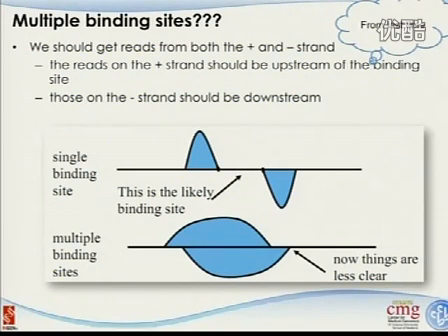And so once you do the analysis, you want to go back to the genome browser to take a further look at whether your strategy is reasonable or not. I haven't seen any established approach to tackle this problem, but it's very possible that before you discard this type of signals, you want to look for the motifs, the sequence features within this region. If you see several things that are pretty similar and they occurred multiple times in this broader region, that is the indication that potentially there's more binding sites in this region.